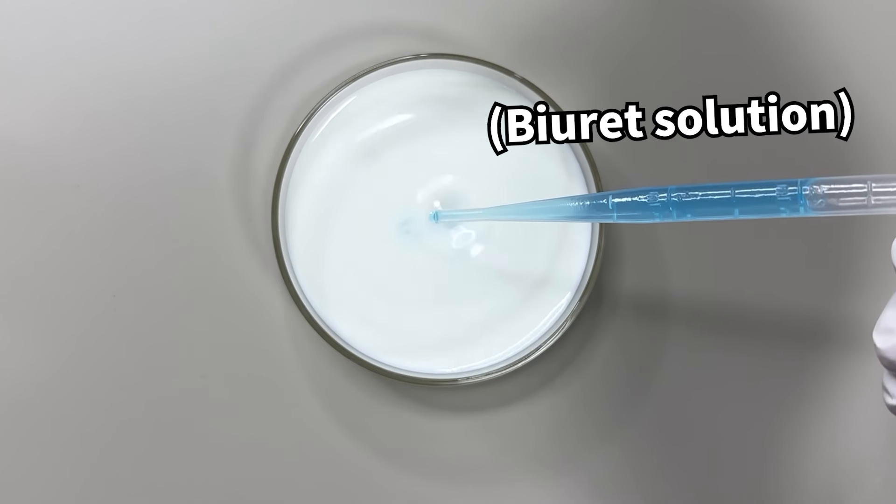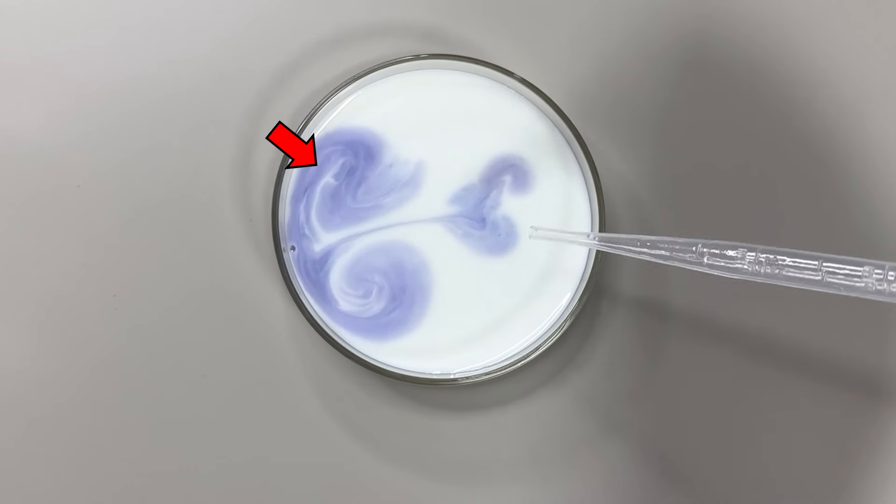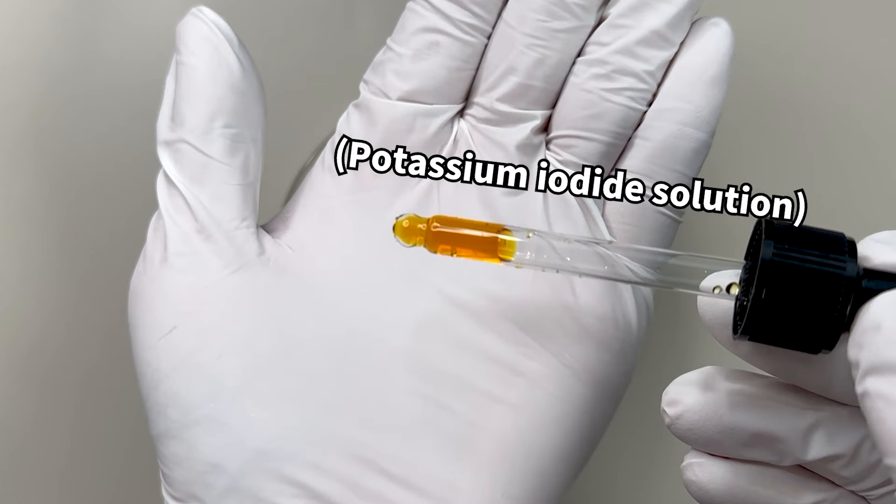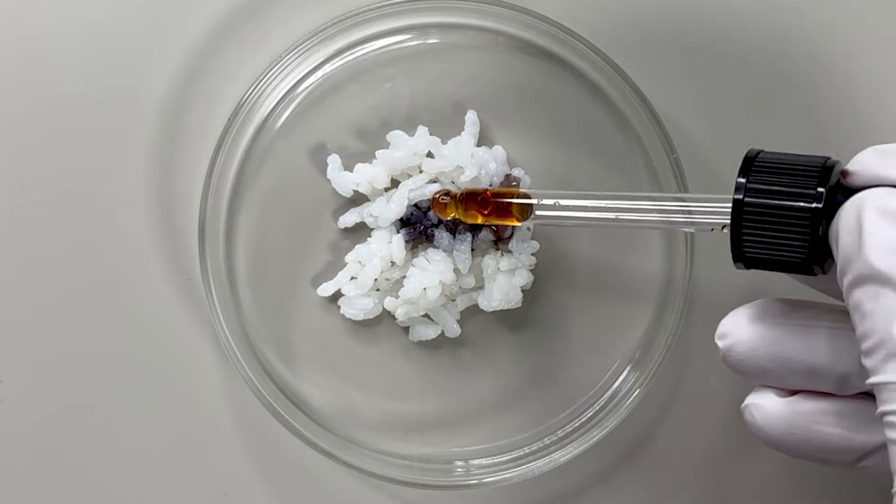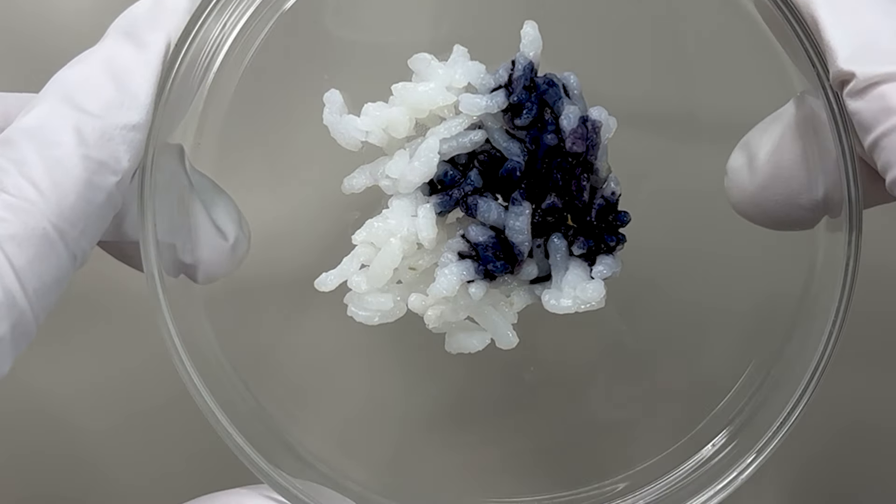For instance, we used a blue biuret solution to detect proteins because it turns purple upon contact with proteins. And a brown iodine solution, which we use to detect starch, turns blue-purple when it contacts starch, as demonstrated here.